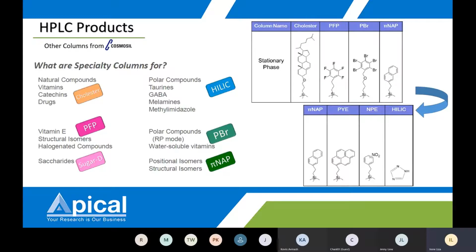Of course, you can ask what's the difference. Basically there's a cost involved as well. The more specific the column goes, the more expensive it gets. So you may want to try with a basic column first, and if it's not giving you good results, then perhaps you can go into a more special or more narrowed base column.